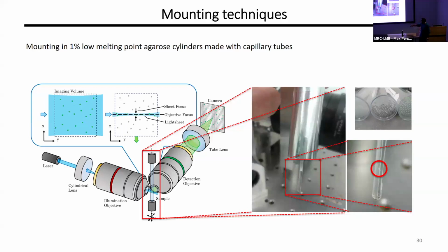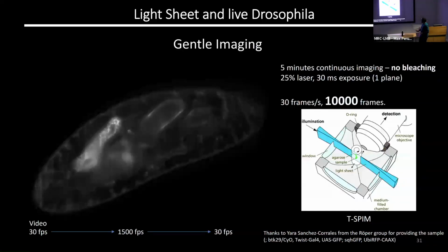You just dip it in the light sheet chamber over there. It's suspended here, and then you can just image it and illuminate it with the two objectives. So it's a different way of mounting a sample. It might need a bit of optimization depending on the sample, but if you're using things like Drosophila and zebrafish, once again, many people already did this, so it's actually getting easier and easier to do. Okay, so just a few examples and a few reasons for using light sheet.